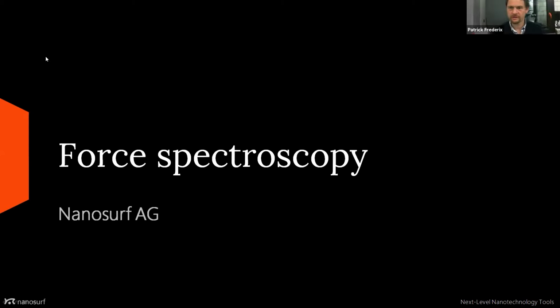Okay, thank you very much, Daniel, and also welcome from me to everyone attending the webinar. As said, in this webinar, I would like to show you how spectroscopy is set up and performed with the NanoSurf software. In the beginning part, I will have some introduction slides. Then in the middle part, we will turn to the AFM software, where I can show you how to perform the experiments. And towards the end, I will shortly also show you our new ANA software to analyze the force curve. But let's first get some introduction slides on force spectroscopy.